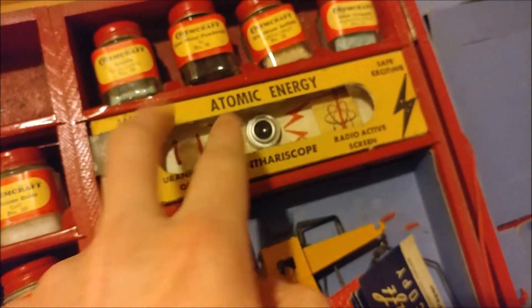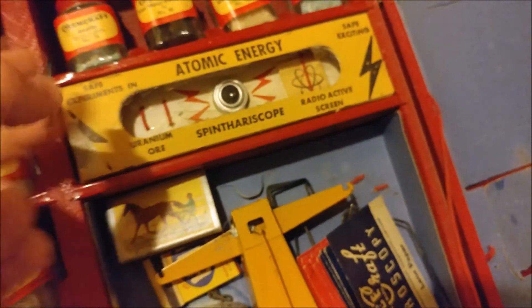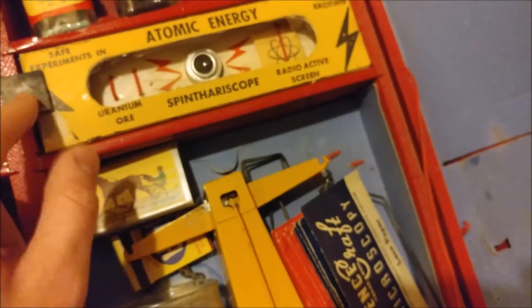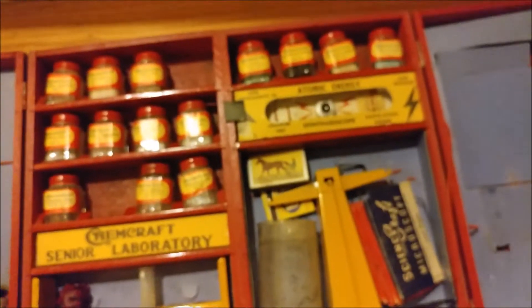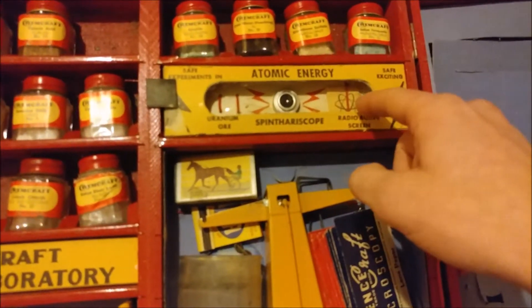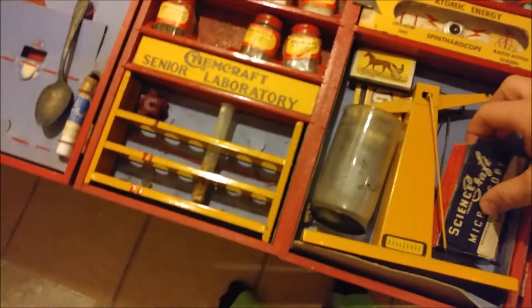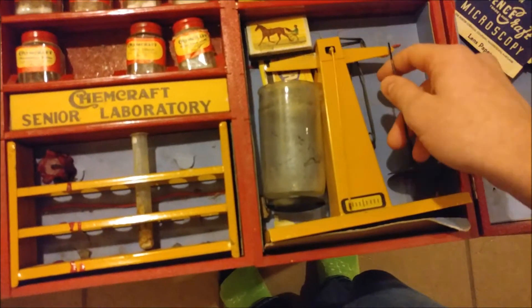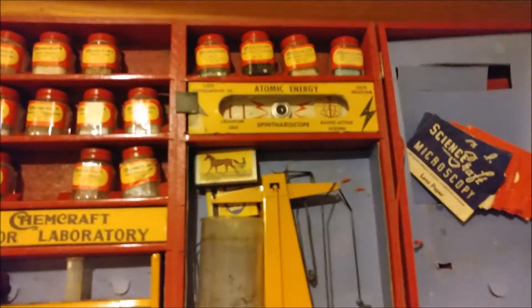Something interesting is it came with an atomic energy type thing, but we don't know where the actual uranium ore is. My dad suspected this might be it, but I highly doubt it — it says uranium ore, not uranium metal. Why would they be giving uranium metal to kids? Uranium ore I can understand; it's not too bad if you keep it safe. There's also a funny little radioactive screen — it's just a piece of cardboard paper, pretty much. And it has a weighing scale, presumably for weighing out amounts and figuring out how much of stuff to mix.